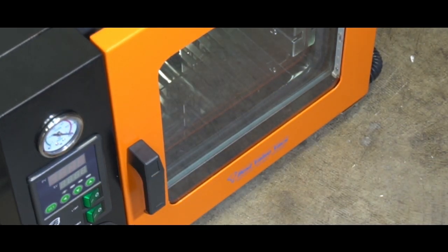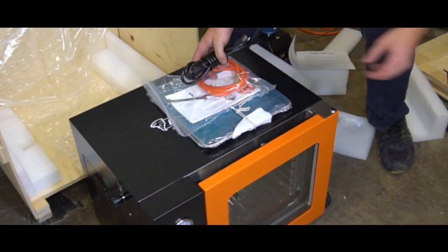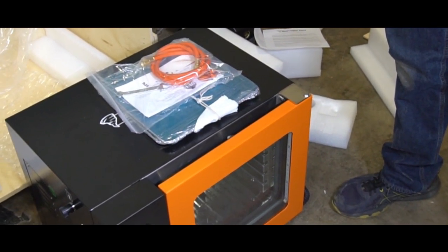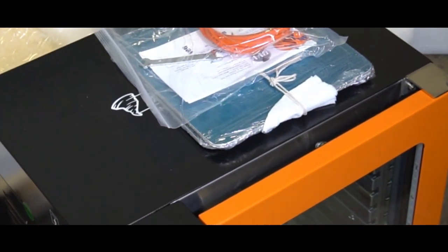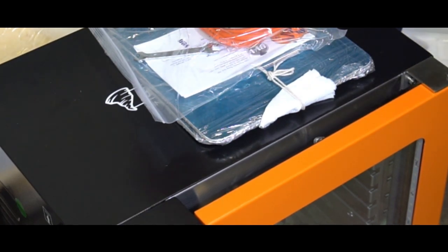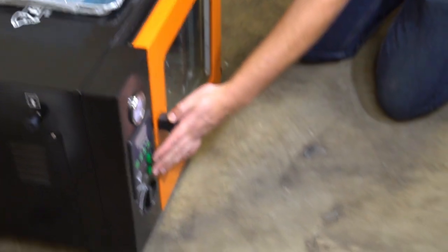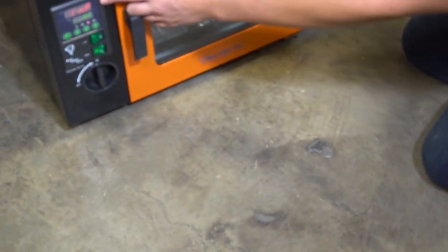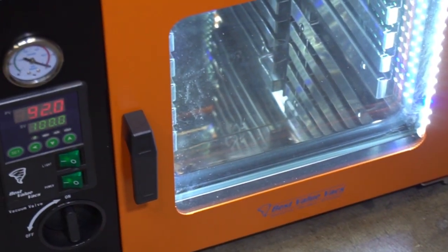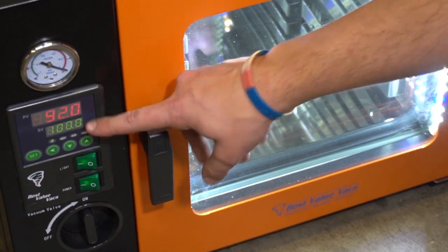The first thing I'm going to do is plug it in and make sure it works. The power cord comes in the back of your container — unwrap it and plug it in. When you hit the power switch, the oven PID will power up and turn on the lights so you can see inside. Right now our temperature is at 92 degrees inside, and our set value is 100, so the oven will start to heat immediately.